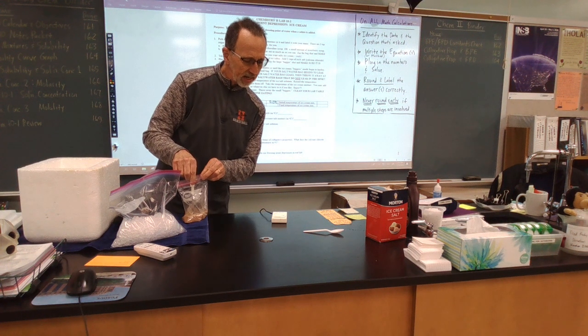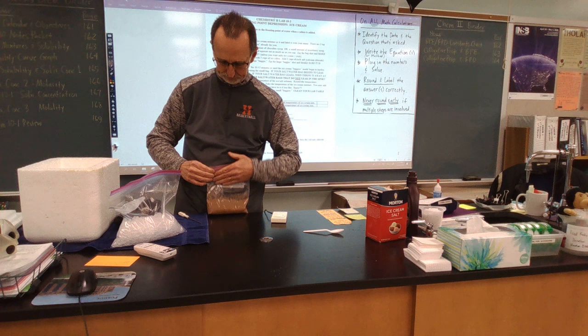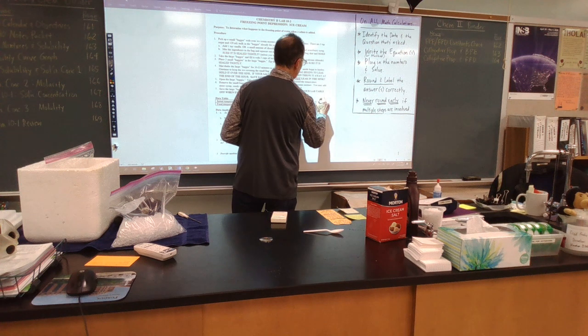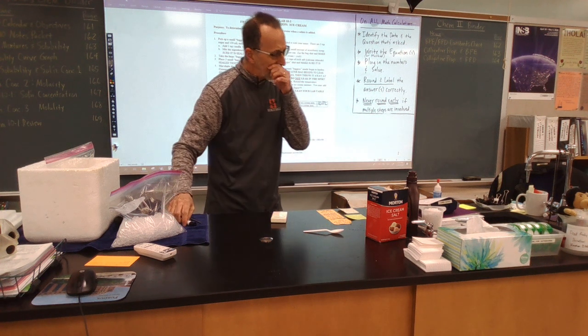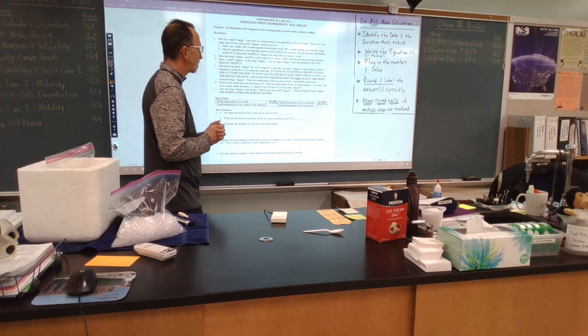And indeed, it is settling in at about 10 degrees. So I'll close this back up and record that. 10.0 degrees Celsius.